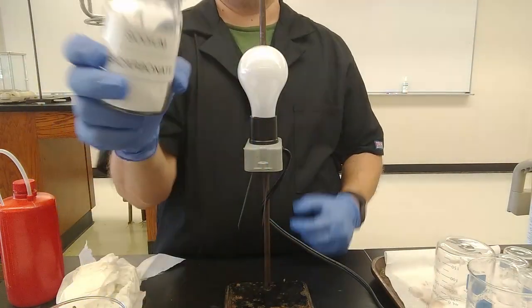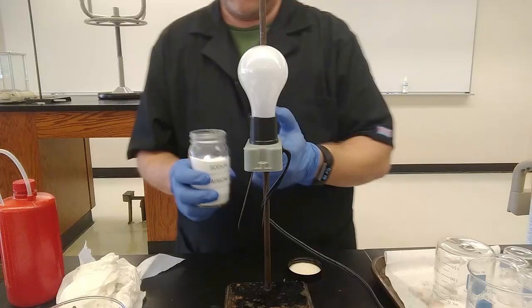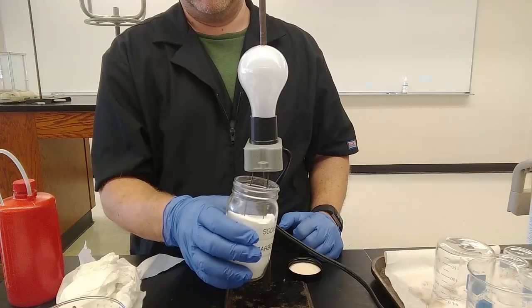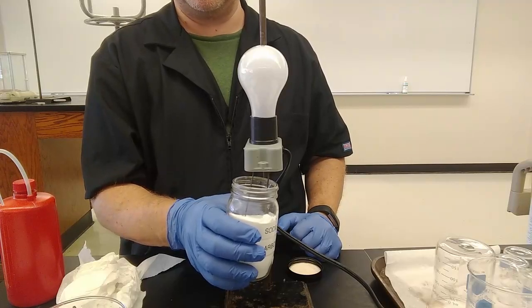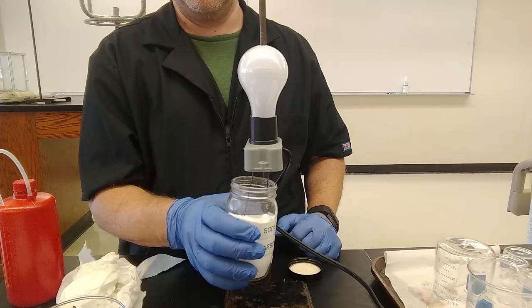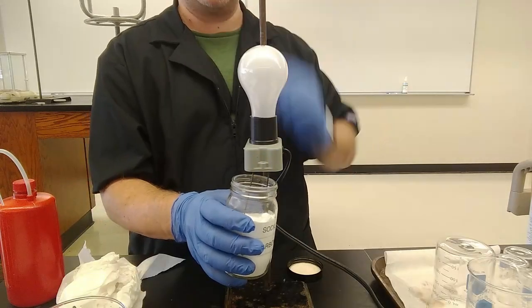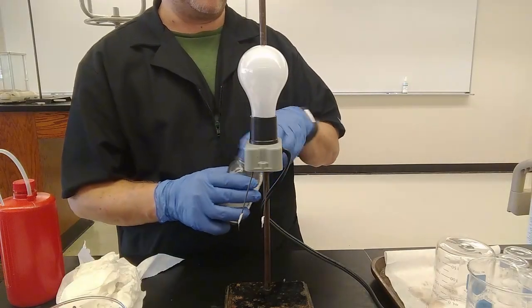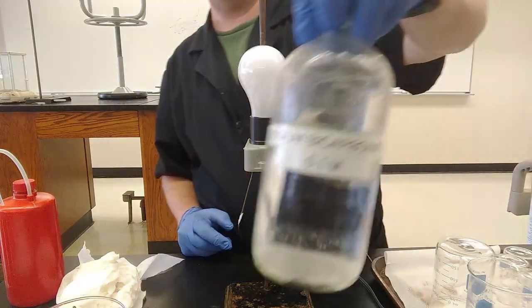All right, well, is this an ionic compound or a molecular compound? Same as the table salt? Still doesn't matter. It's a solid. If there are ions present, and again I have to leave that to you to decide, they can't be mobile enough to allow a transfer of electrons from one wire to the other, to allow conduction. So it doesn't work. Nothing. Again, I put a line through that final column because it is a solid. We can't test it. Not validly.